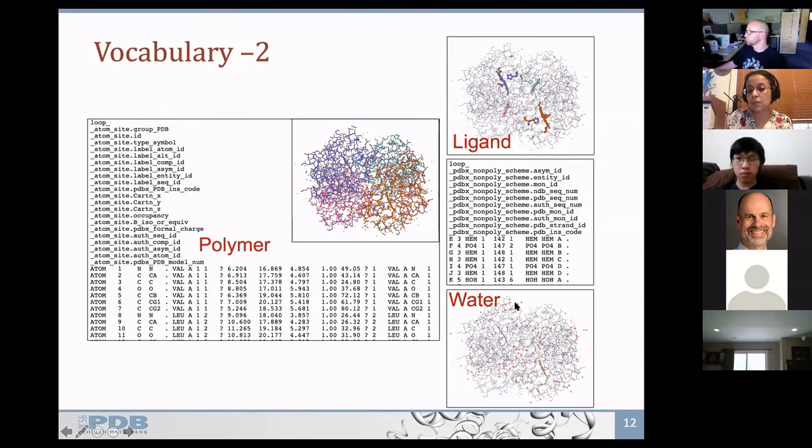And then there are these water molecules that will show up. These are the little red spheres that show up all over the space, and you can turn them on and off. Many times these water molecules are just creating a hydration shell, but sometimes they have key roles to play in stabilizing interactions or even participating in the chemistry that was captured in that particular structure.